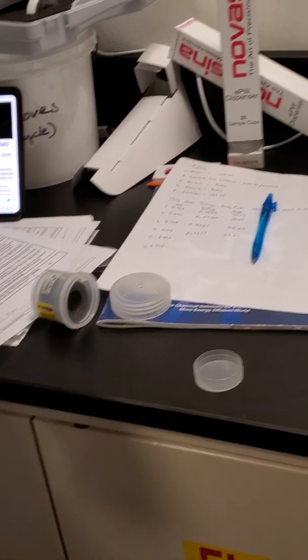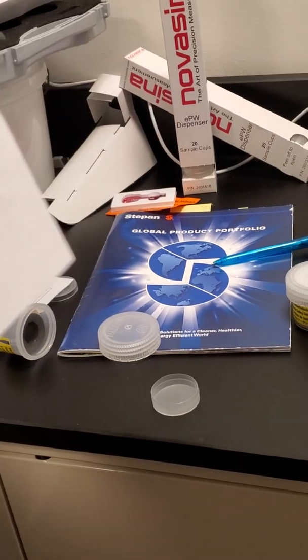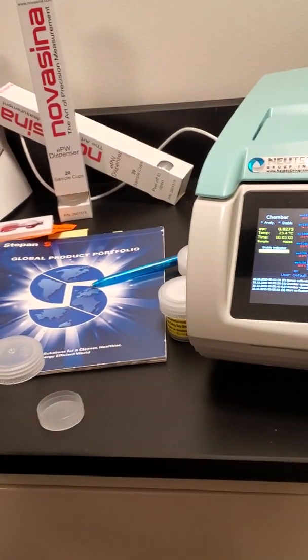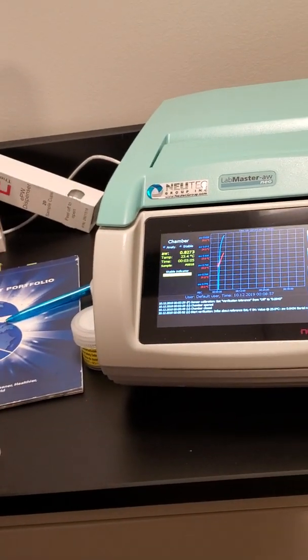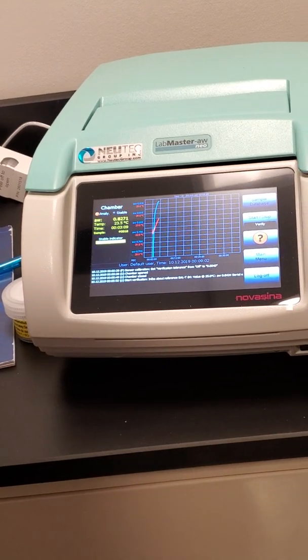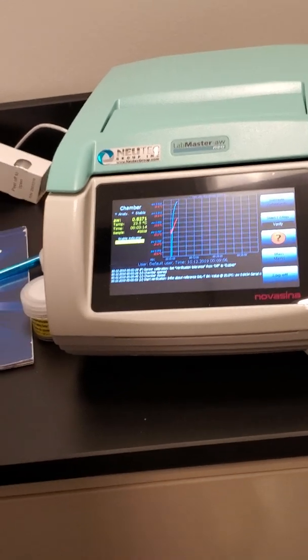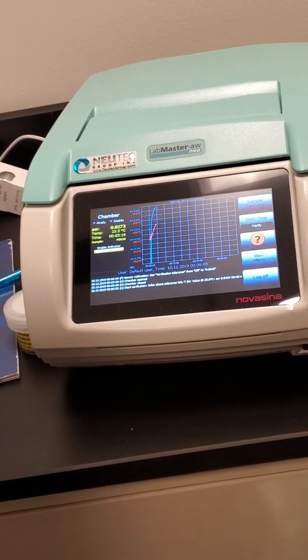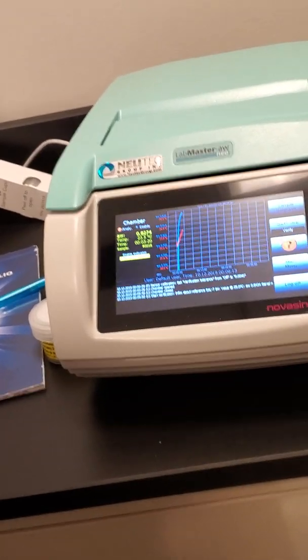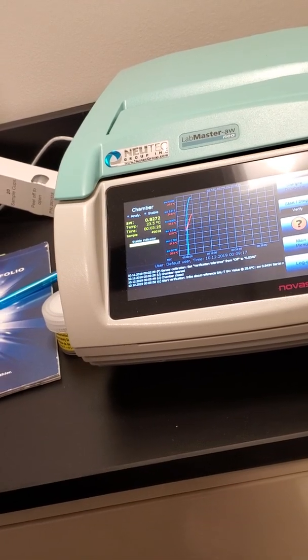Okay. And I did write down here, I'll give you these results because these are the readings that I got, but I also wrote down the different potential filters that you will need for each of these products that I saw in there. You'll probably want, I mean, the essential oils is the only one that needs this VALC filter. And if you don't really do a lot of those, or if you don't really have methanol, then you may not need to have that one. You could get away with just the 21 and the Redox.